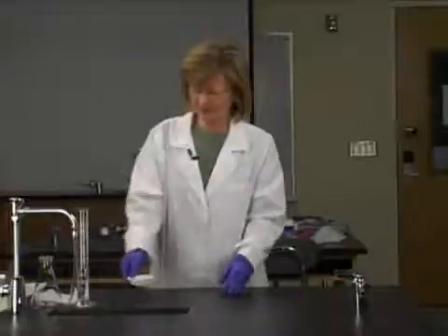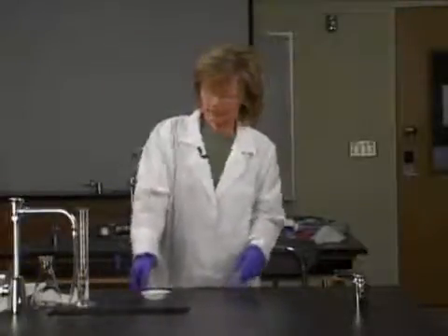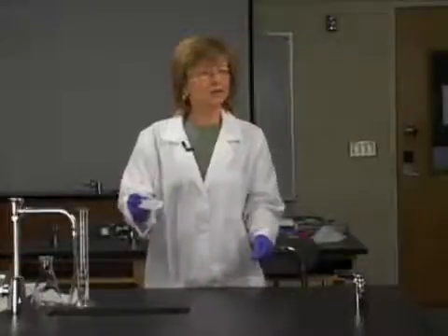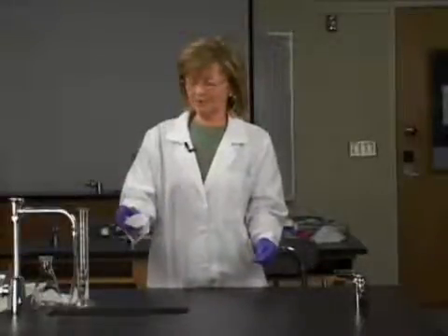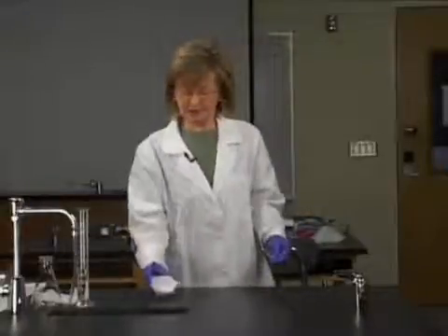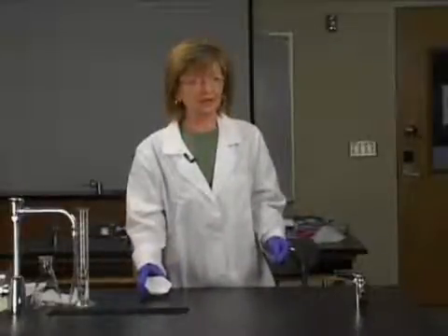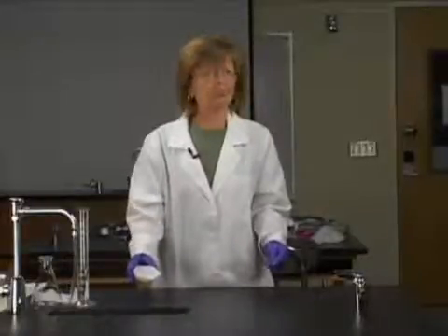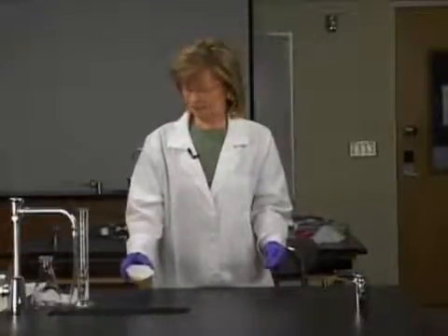And I have here in this little weigh boat about 0.32 grams of regular agarose. You can't really see it. It's very pale, and there's not a lot of it because I'm making a 0.8% regular agarose gel.